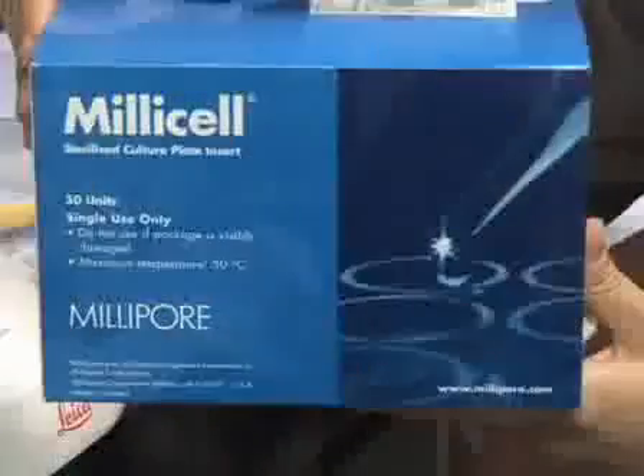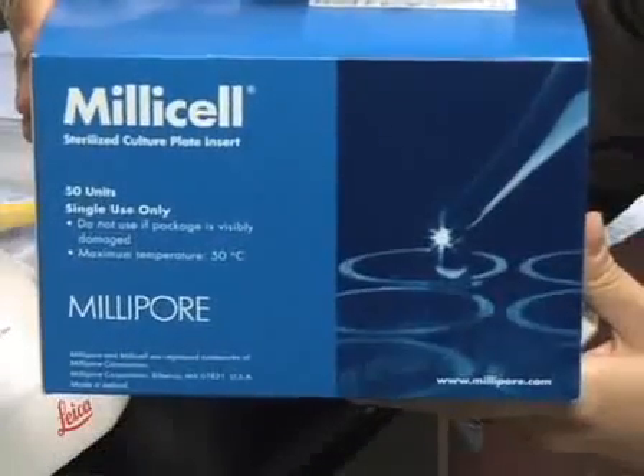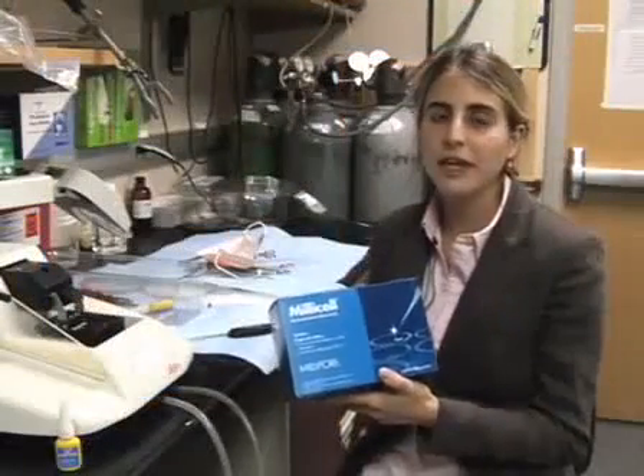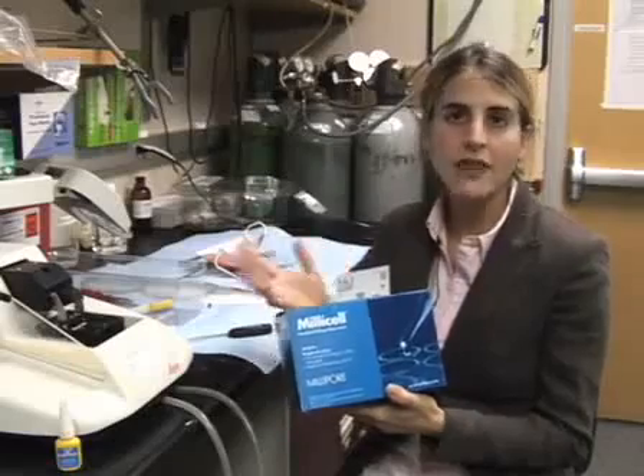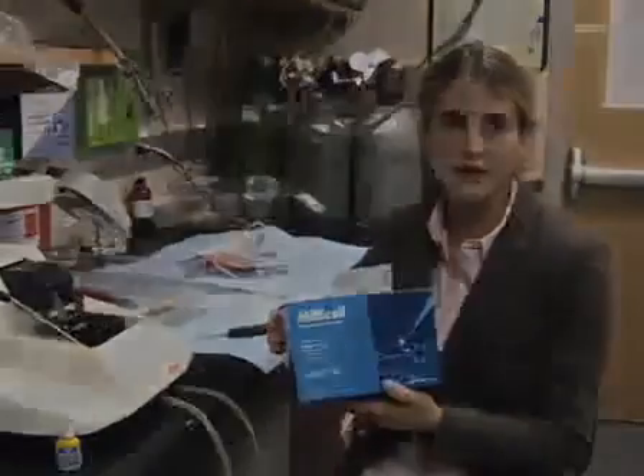We also use these Millicel filters. These are the filters that we plate our slices on while they're in culture, and this is also an important part of the process.